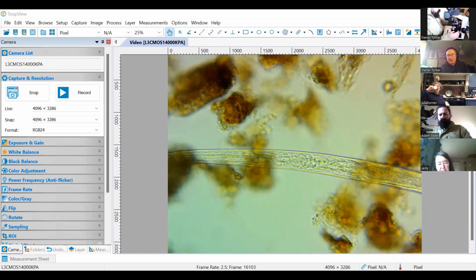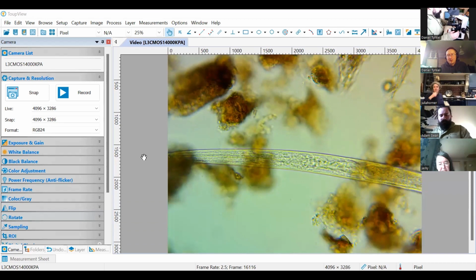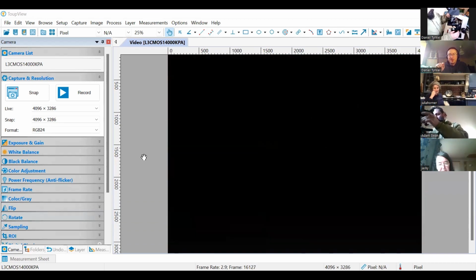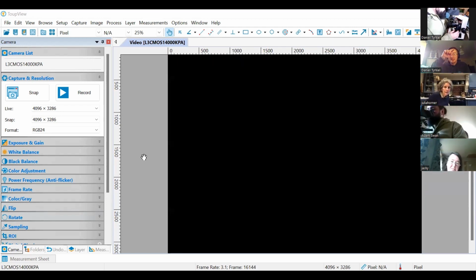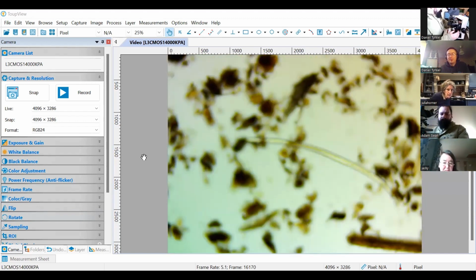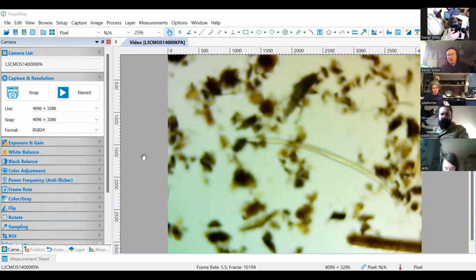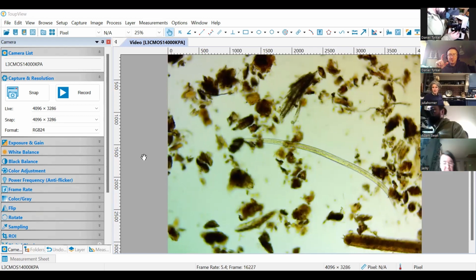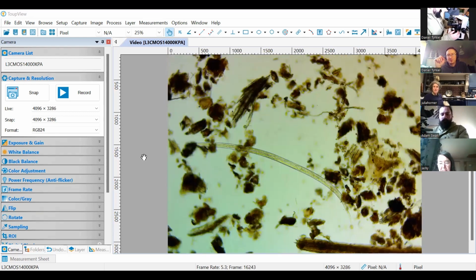Just to quickly say, you can actually see the entire drop under the microscope at 100 times magnification just by going in a zigzag pattern, one next to the other. It's basically a scanning pattern, and so you can count all nematodes in that drop. And when I was mentioning that for scientific reasons, if you want to make this reliable, what you find is that in the same cup that you just prepared, different drops will contain different numbers of nematodes.